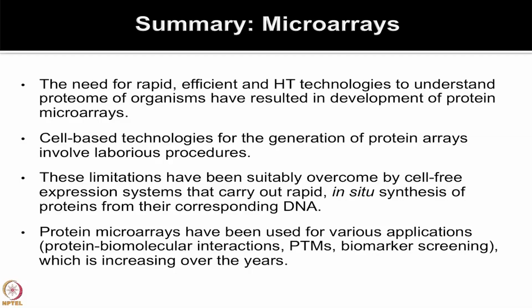I hope you are convinced that protein microarrays are a very rapid, efficient, high throughput platform to provide various types of applications. Both cell free and cell based arrays have been used. Cell free arrays have overcome some limitations which were otherwise not possible using cell based arrays. You can go to PubMed and look for literature, you will find n number of applications, whether it is biomarker discovery, looking at post translational modification, protein interaction, kinase substrate analysis, a variety of things using arrays for every organism of interest. Of course, more on the human, but you will see n number of applications for all the life sciences.